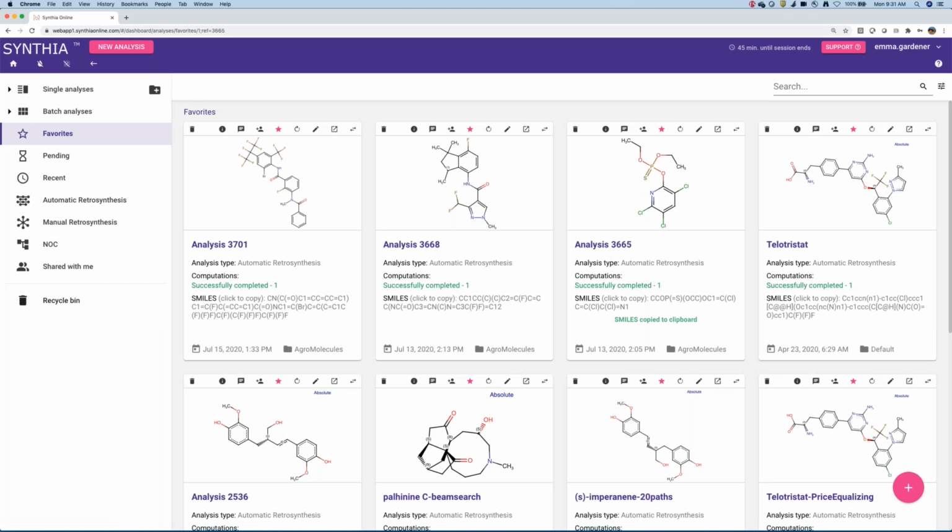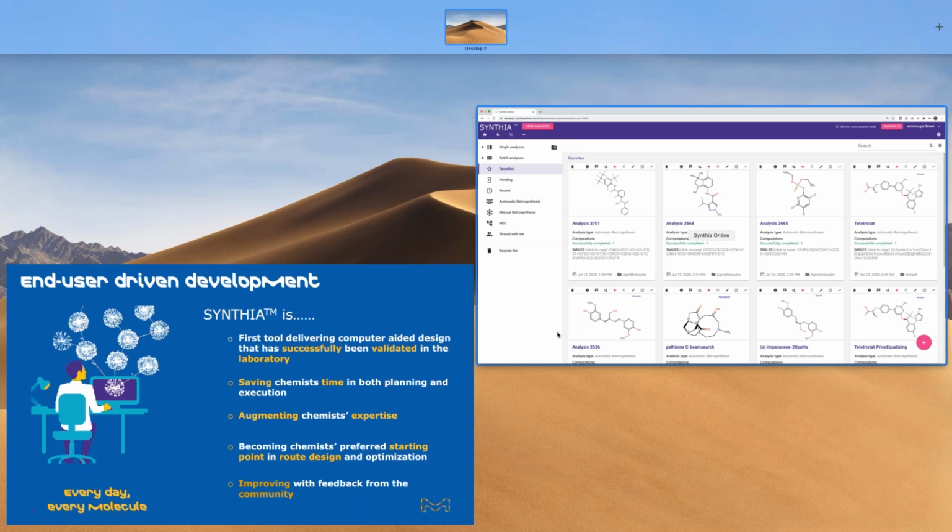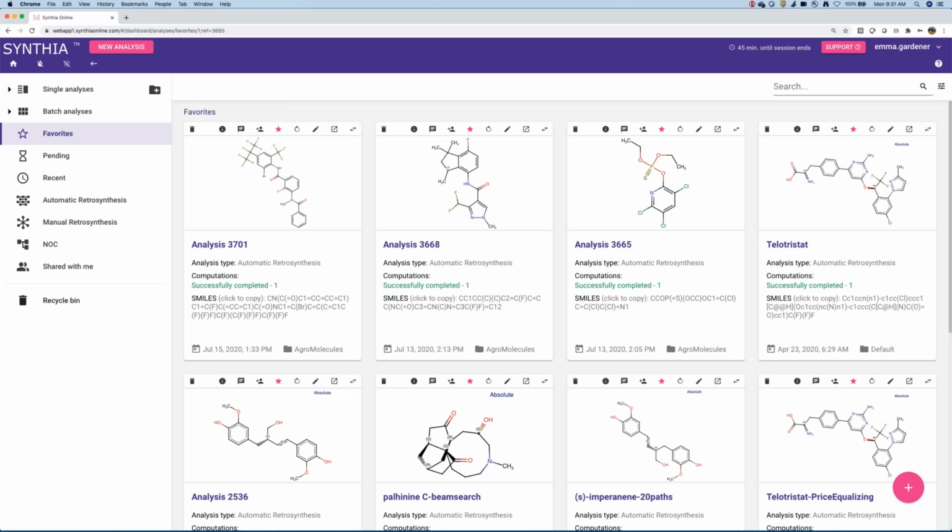Great. Are you seeing my screen again? Sorry. Yep, we've got you again now. Okay, perfect. Great, so then this is what our Synthia web app looks like. So we first launched this web app version commercially about a year ago, I guess maybe a little over a year ago now, in March of last year.